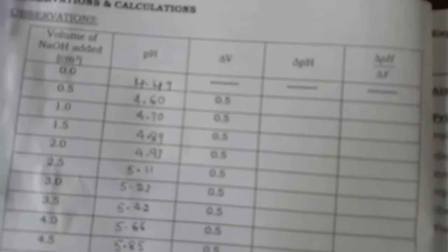Now it is based on the Henderson-Hasselbalch equation. We have pH is equal to pKa plus log of salt by acid. So when salt and acid concentration is 50-50, then we have pH is equal to pKa.